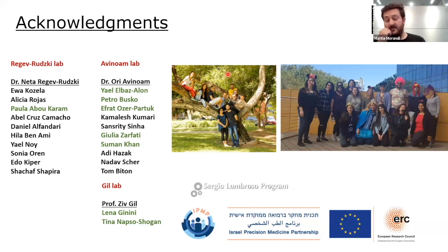So yeah, this is a very good point. That's why I think it's very interesting to look at EV subsets specifically, because as I mentioned, we are looking at the bulk. And if you notice in our Western blot, we had both CD9 and CD63. We cannot tell which is which in driving the fusion.